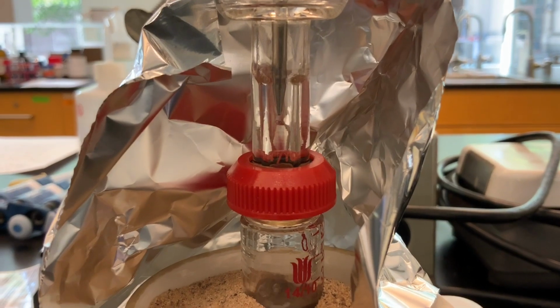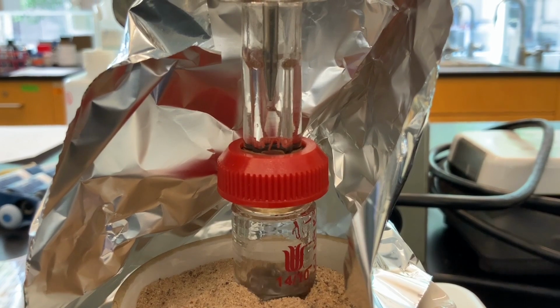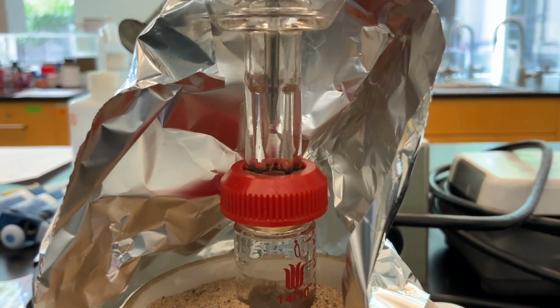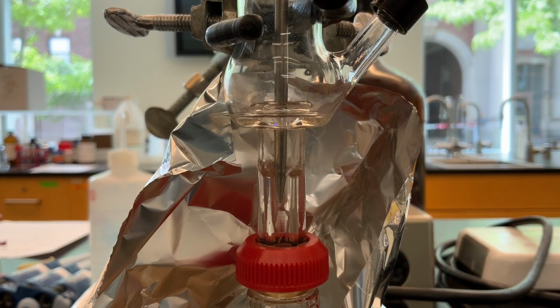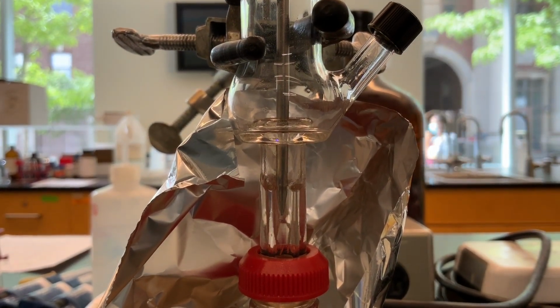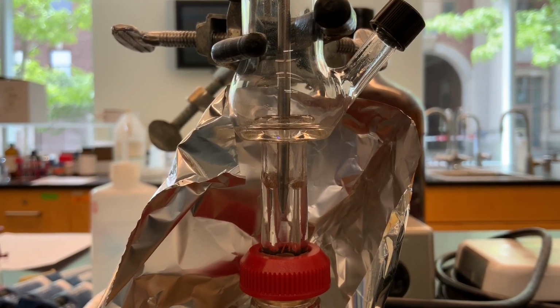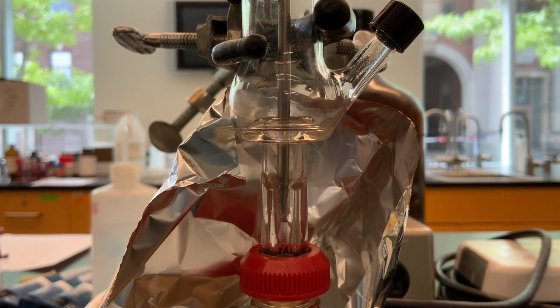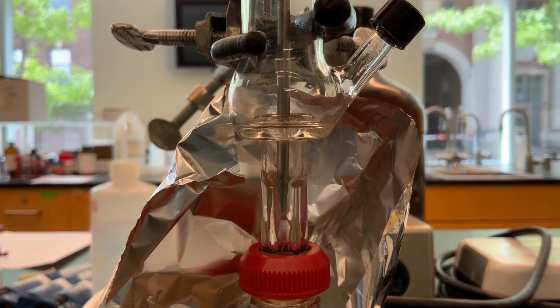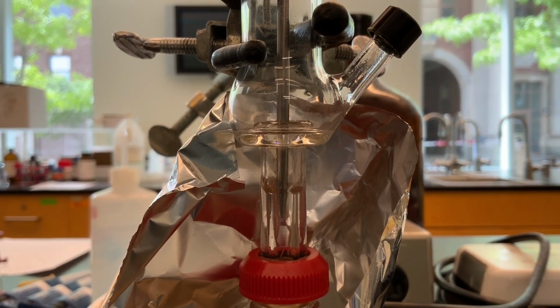And of course, we see that the distillation pot or the distillation vessel, our 5 milliliter reaction flask, is boiling down there. And we're at 75 now. Look at that. You can see the vapors just really nicely climb over. Filling the well very slowly. 76.1.